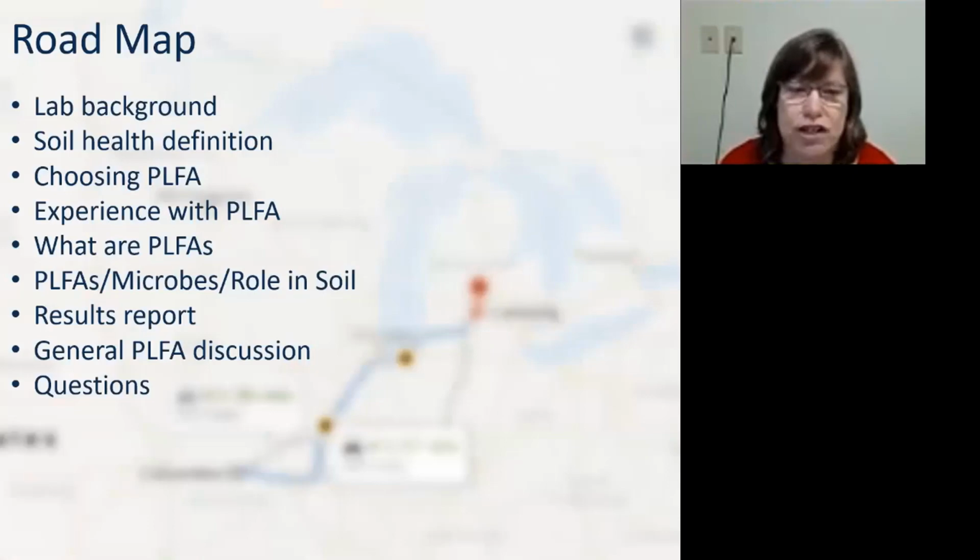I will go through an actual soil health PLFA results report, and then just give you a little bit more information about PLFA and how we do it, and then at the end have time for questions. So while we're going through this, write down any questions you may have, and maybe they'll be answered, maybe they won't, and then we can discuss those in the end.